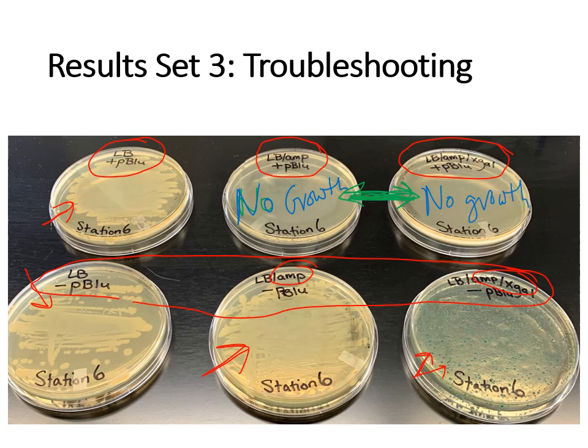And so when you analyze this set of plates, I want you to analyze every single plate. Ask yourself, is it what you were expecting? If it's not, what could have gone wrong? What leads to that result normally? What does that tell you about the experiment? Okay, be as specific as possible. Make sure to mention things such as beta-lactamase, beta-galactosidase, ampicillin, XGAL, plasmid, no plasmid, all of that stuff.